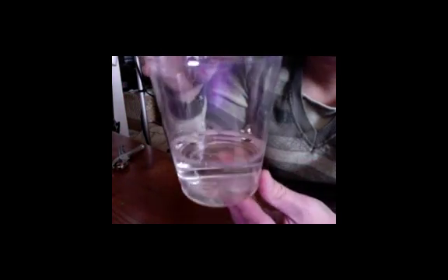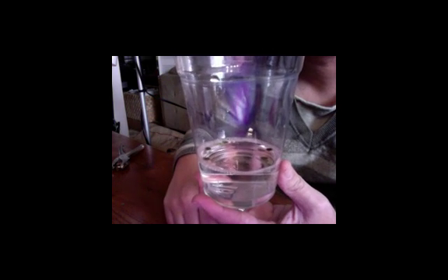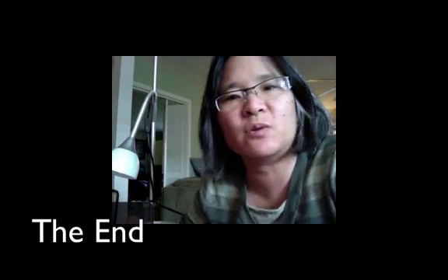Okay, so about after 12 minutes, finally, they all have floated. All 10 are at the top. I've recorded it in my data table and I'm pretty much done with this experiment. So the assay is pretty easy to use. And again, the assay is an indirect measurement of the rate of photosynthesis using a regular light in this particular case. When you guys do your own experiments, though, that's where the fun begins because you'll get to use any variable that might be interesting to you.